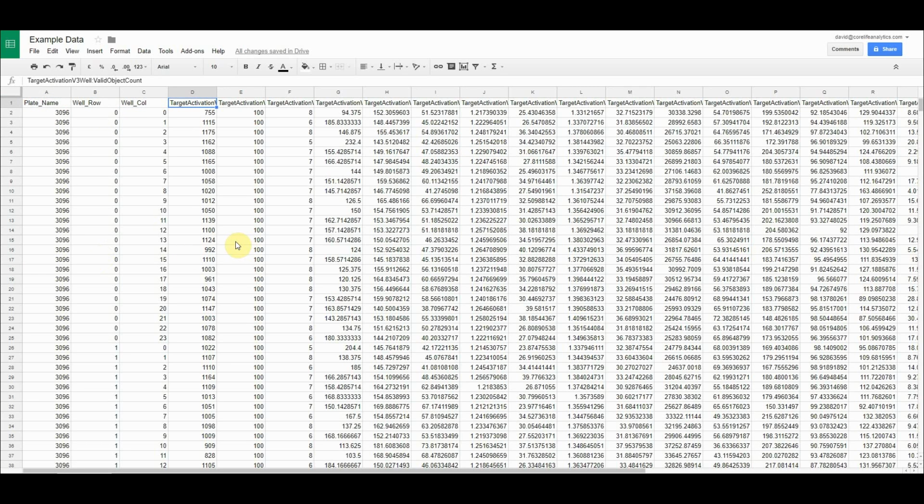Now, there are a number of things to watch out for. Each file or each plate has to have the same number of columns. You can't have, say, a number of plates in an experiment that have 12 and then other plates that have, let's say, 15 columns. This will cause problems. Also, avoid commas and semicolons in plates that use these as delimiters, and be very careful with Excel because you can introduce artifacts when copying and pasting that may not be obvious.